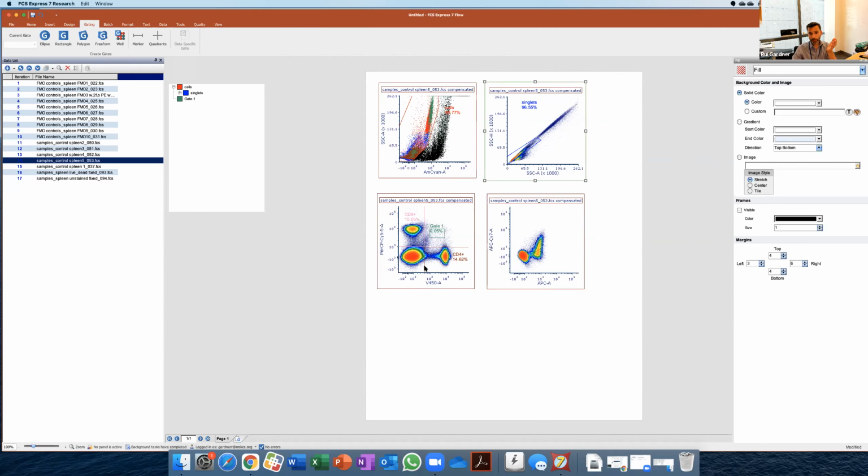You can check, right, to see, let's say if I would pull the gate, so it's 14.62, and if I go over here and eliminate that, that's 14.24. Is it a big deal? Again, within the percentage of the frequency that you're expecting, no, it's not going to be a big deal, but it could be, right? So you may want to look at these things and try to go back and adjust and make sure that these gates are appropriately set, right? Actually, the nice thing here is that we can undo and just place it back, right?